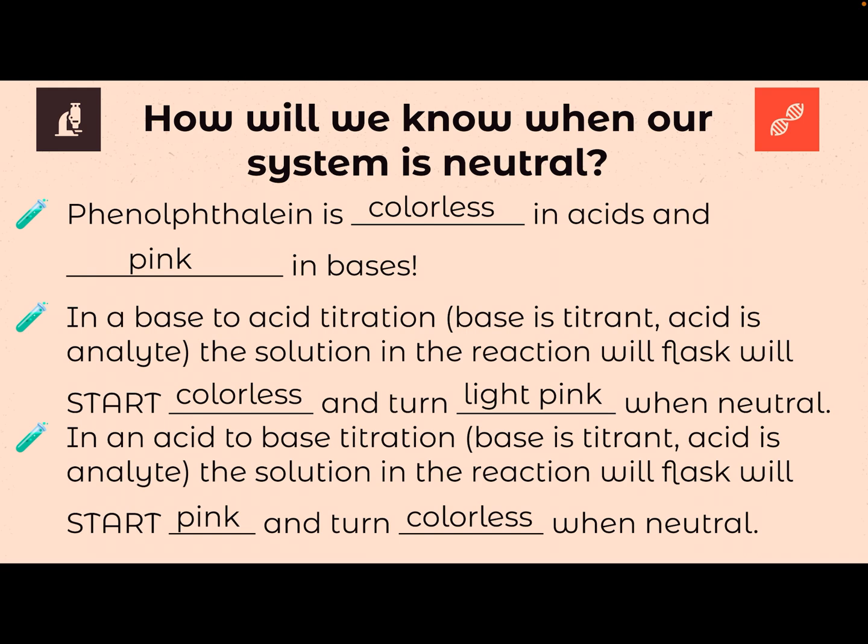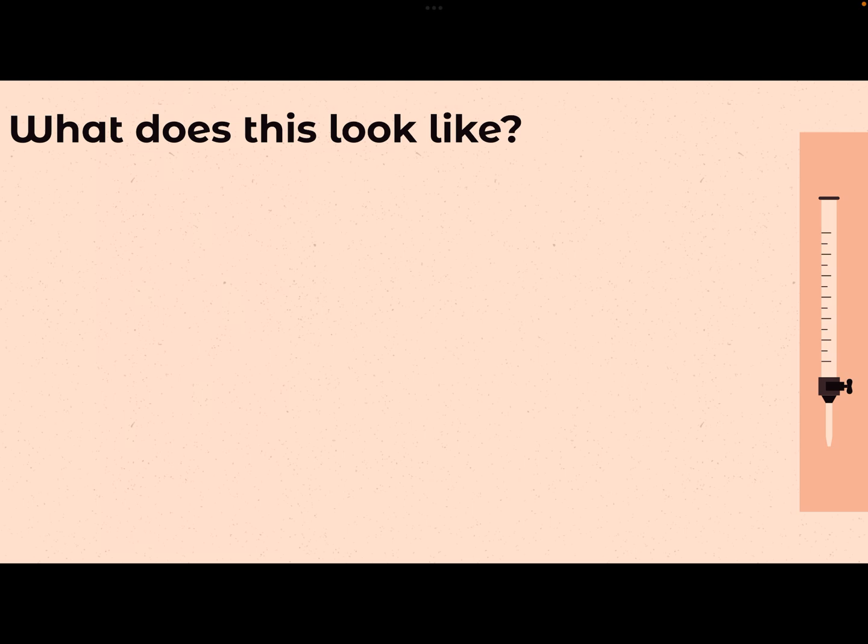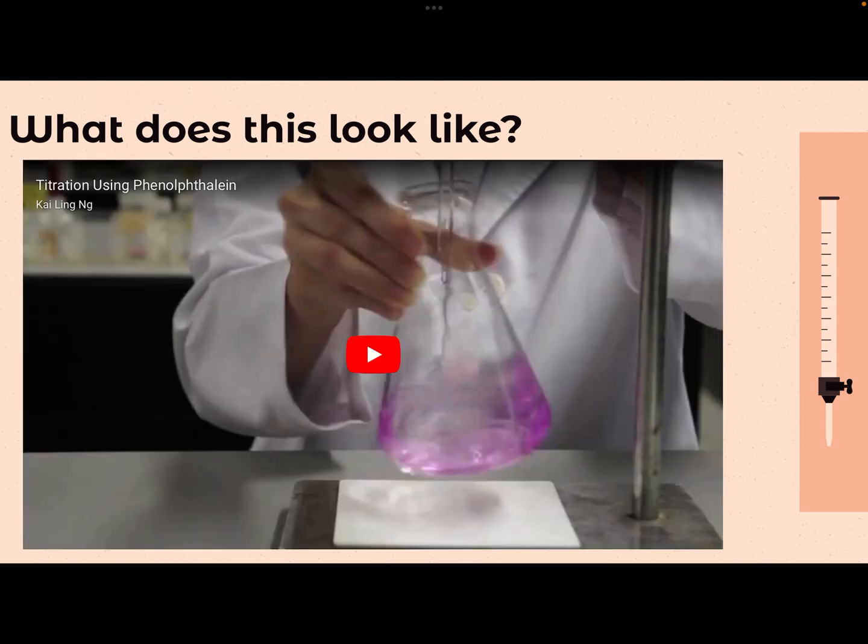Okay, so keep in mind, especially for number 4, you're looking for that faint pink color. So what does this actually look like? Let me show you a little video here.